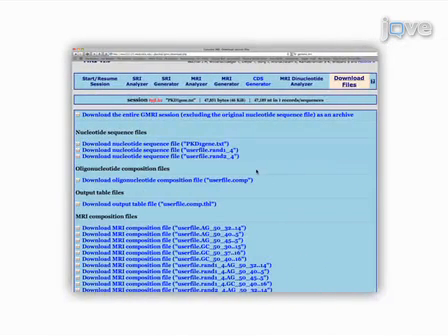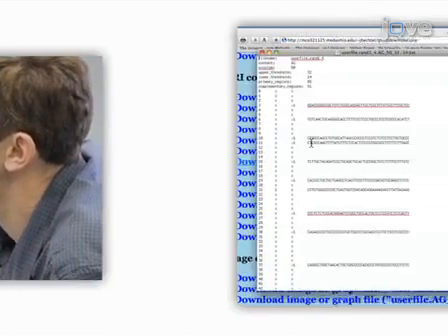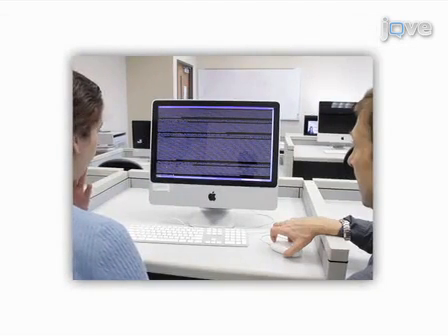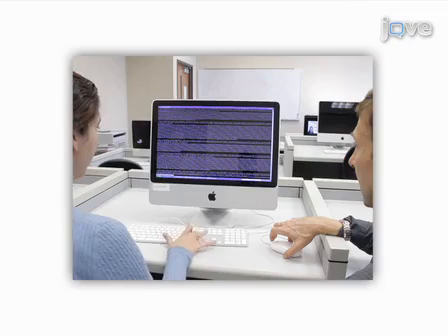The final step of the procedure is to download the files containing sequences of all MRI regions detected by the program. Ultimately, results can be obtained that show a majority of genomic regions of multicellular eukaryotes are significantly enriched by segments containing base compositional extremes detected for each of 4 nucleotides or any of their combinations. These inhomogeneic regions are associated with unusual DNA conformations and/or particular DNA properties.